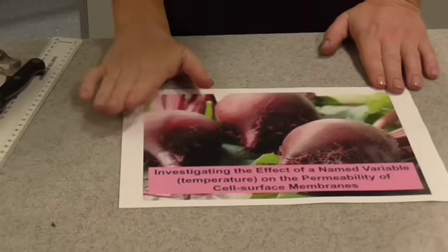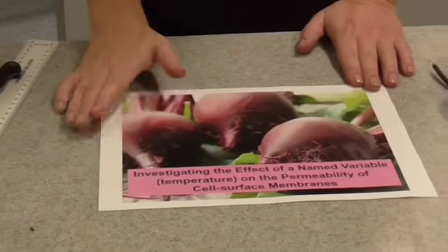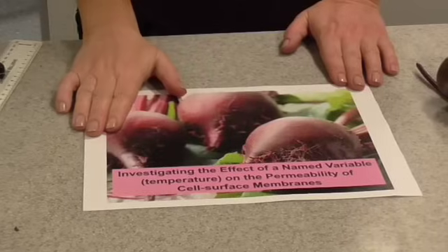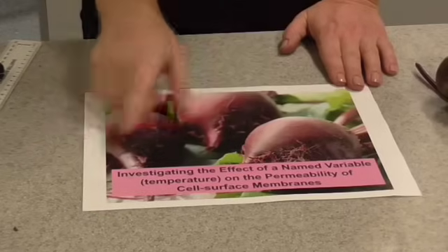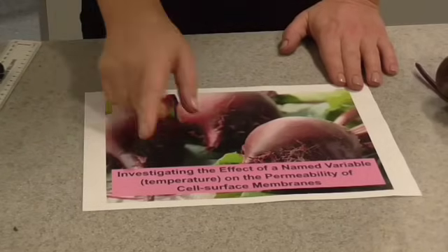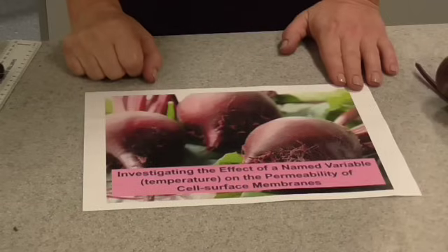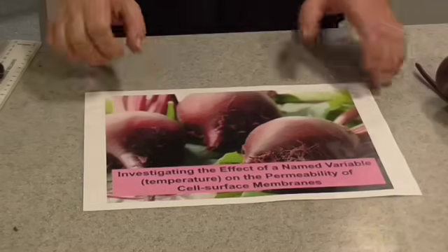I'm going to show you how to do one of the required A-level biology practicals. This is for AS and A-level, where you're going to investigate the effects of a named variable — in this case temperature — on the permeability of cell surface membranes.